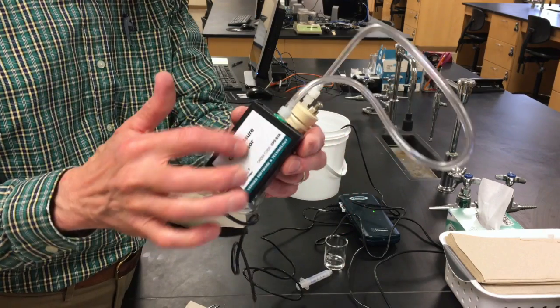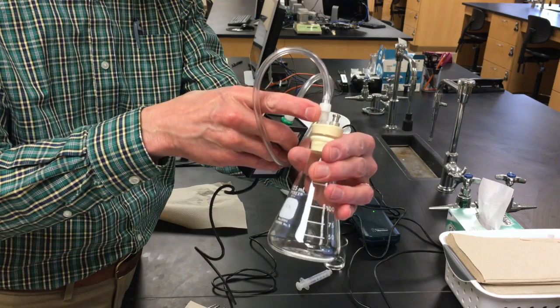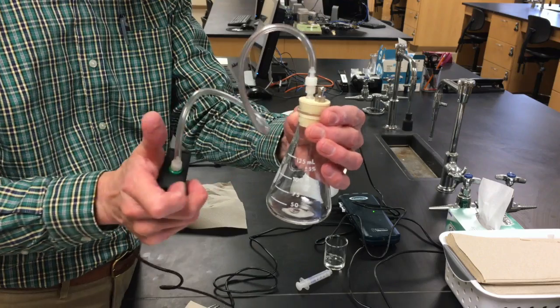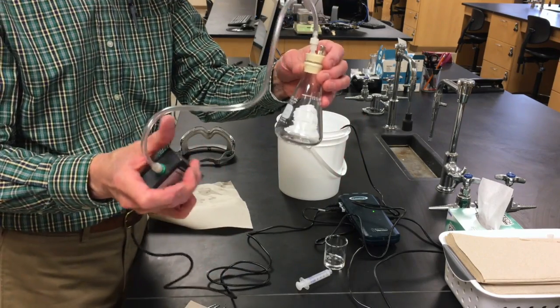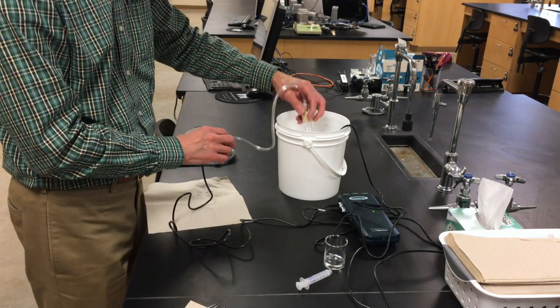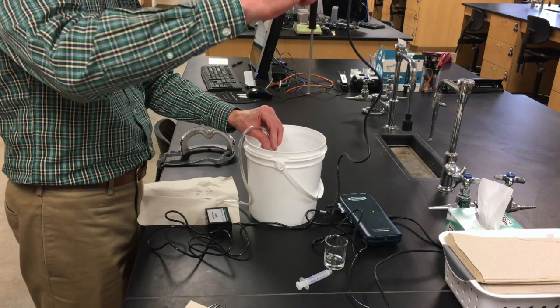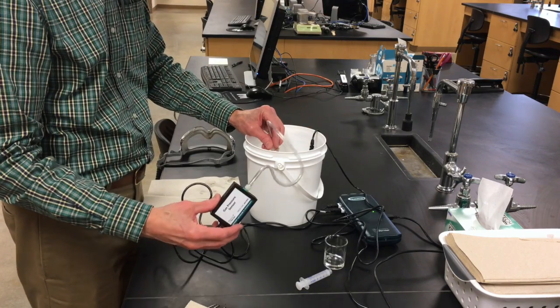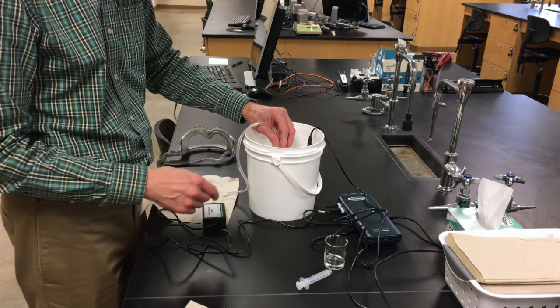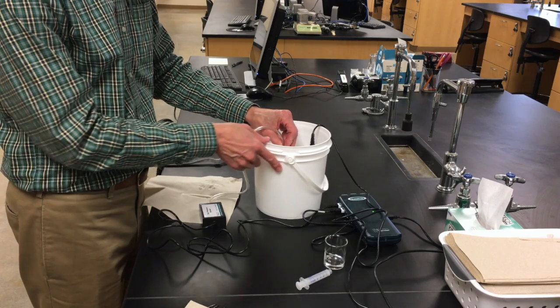So now the sensor itself is sealed. There's a good seal there. There's a good seal here. The only opening now is this metal port. And that's the way we want it when we're measuring the air pressure. We're going to put this into the water bath. We've got our temperature probe in here. We've got our gas sensor hooked up to the Vernier interface box, and so we'll be able to measure the gas pressure at this point.